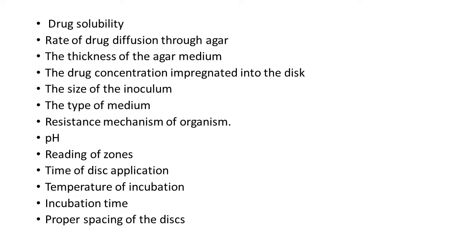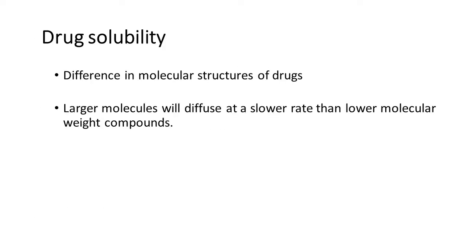These are the factors that influence the zone size. Drug solubility: the solubility differs with the molecular structure of the drugs. A larger molecule will diffuse at a very slow rate compared with lower molecular weight compounds.